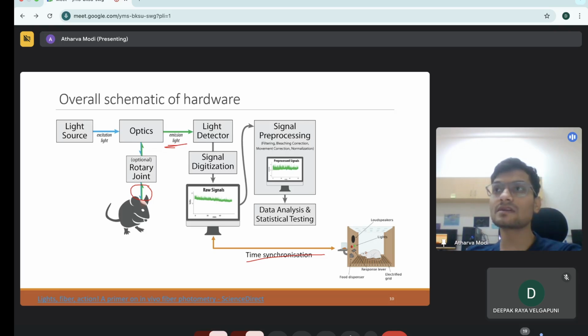Are rats the typical model system for this technique, or could you use smaller organisms? So we can use rats, mice. People do this kind of technique in in vitro cells also. You can do it in slices, brain slices also.